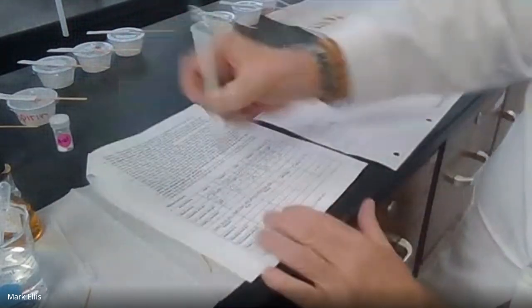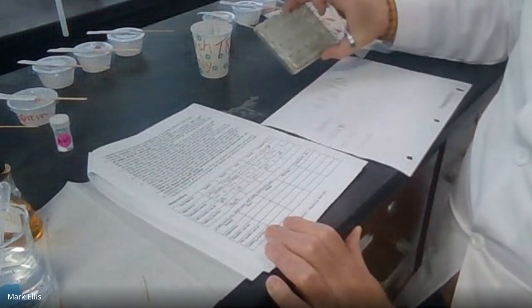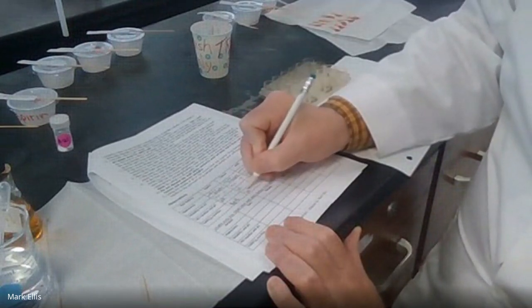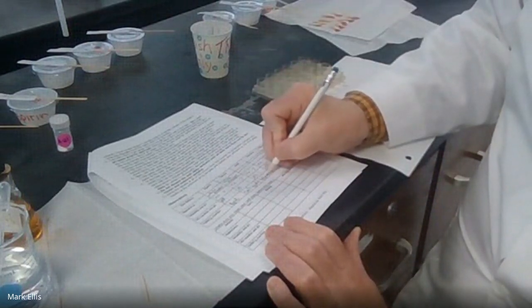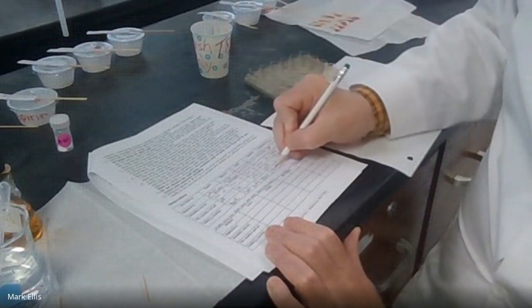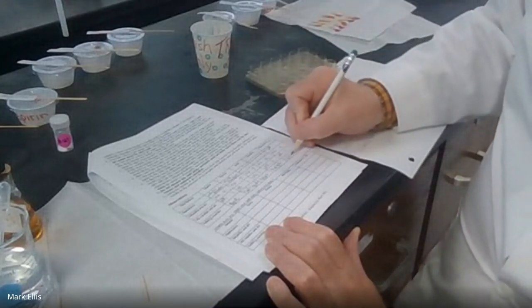So again, I would record, or my lab partner would record the colors. We all need to kind of agree on what colors it is. So like maybe a rose, a dark blue. For the Advil, it was kind of a yellow. And for the Excedrin, it was a purple. And for my unknown, it's got to be aspirin. It was kind of that rose colored.